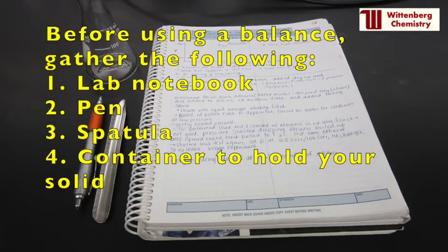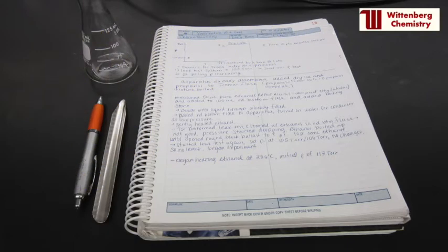You will need the following when using a balance: your lab notebook, a pen, a spatula, and a flask or beaker to hold the weighed solid.